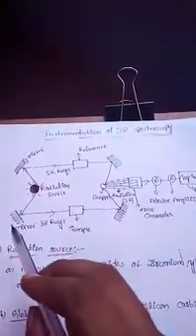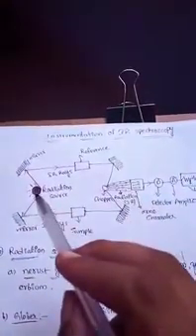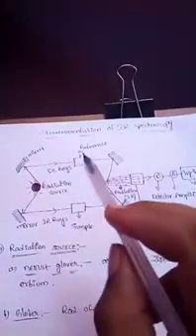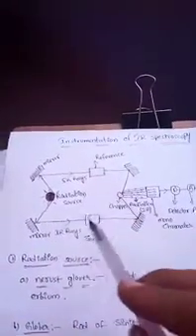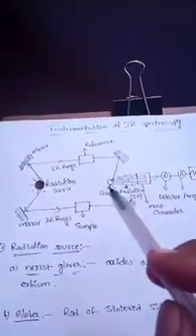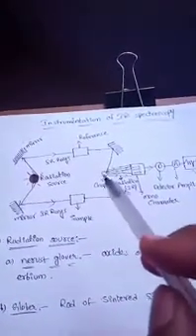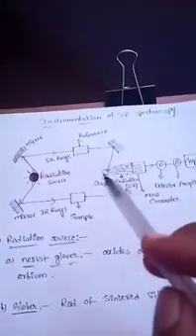These two are the mirrors. These two also are mirrors. Next, the radiation source releases IR rays to both sides. From the top direction we take a reference material, and in the bottom direction we take a sample material. The reference material releases a reflection ray, and the sample material also releases a reflection ray. These two move towards the chopper.